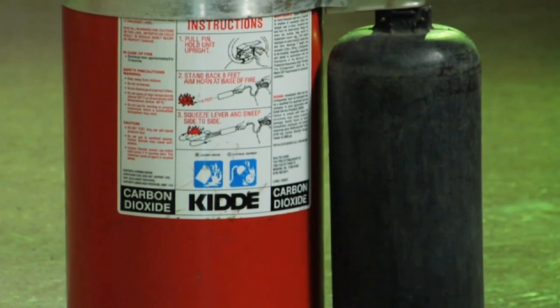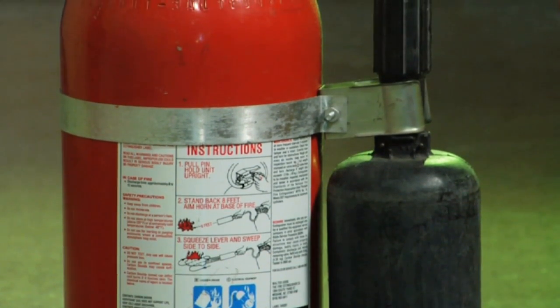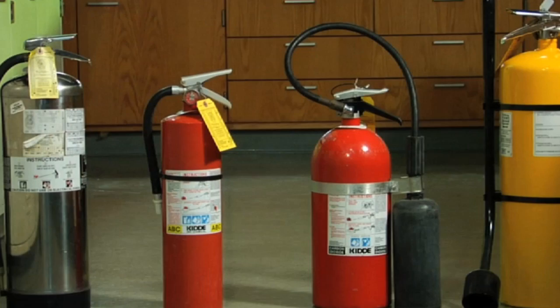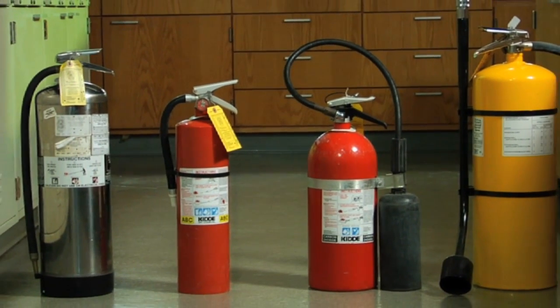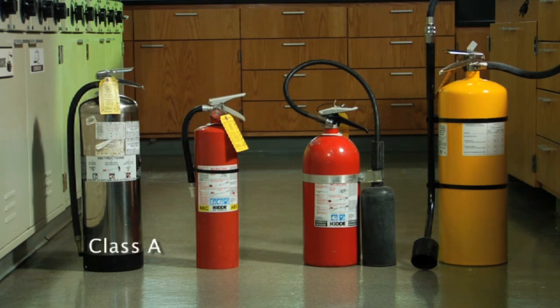Know how to select the appropriate fire extinguisher. Read the label on the fire extinguisher. It identifies the type of fire it can be used for. Fires are classified according to the material that is burning. The types of fire extinguishers used in a lab are Class A, Class B, Class C, and Class D.